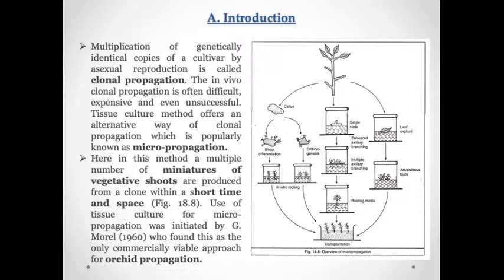This technique was initiated by G. Morel, who found it very commercially viable for orchid propagation. So orchids, the fancy plants, are quite highly used for the same.